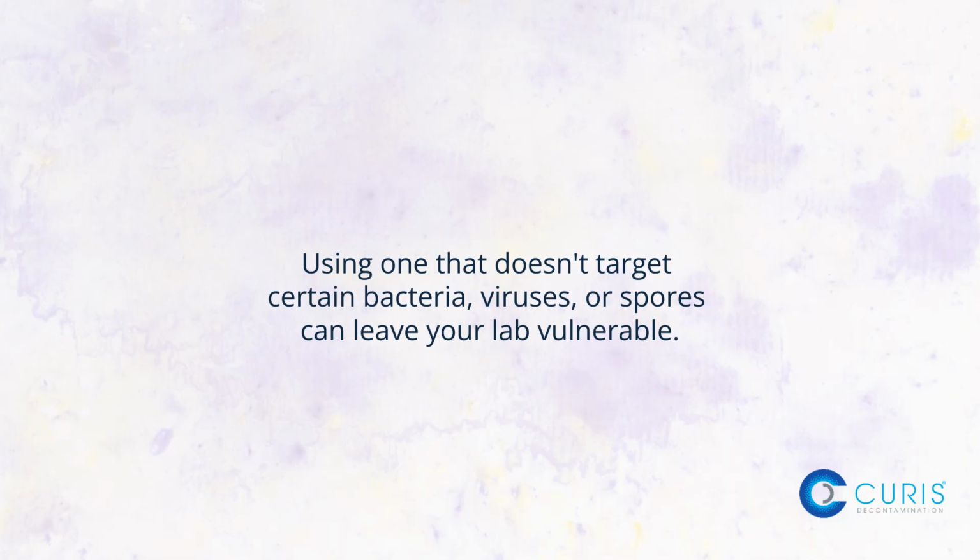Even well-run labs can run into avoidable disinfection errors. One of the biggest is using the wrong disinfectant for the microbial threat. Disinfectants are not universal, and using one that doesn't target certain bacteria, viruses, or spores can leave your lab vulnerable.